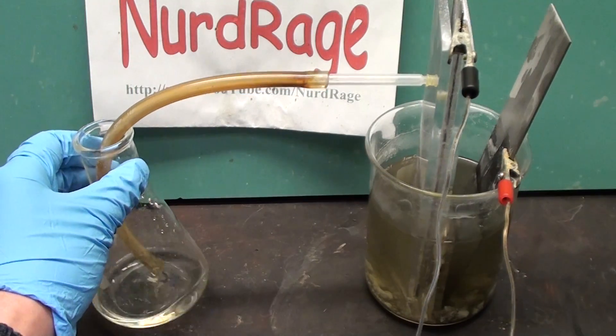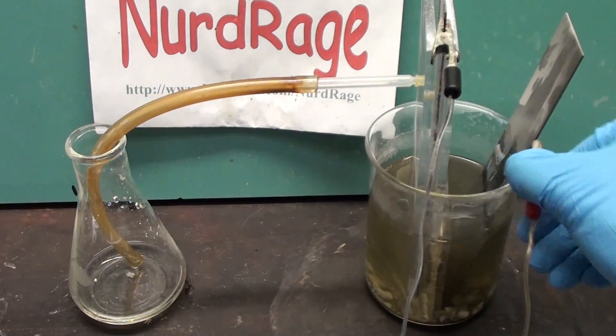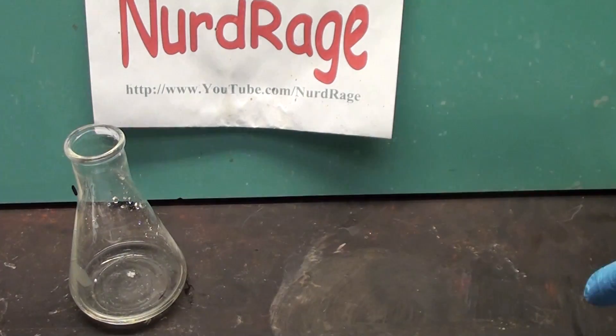Ok, so I've run the cell for several hours and we have a small amount of sodium hydroxide already collected. Let me pour it into two vials. To test it, I'm going to add hydrochloric acid to one.